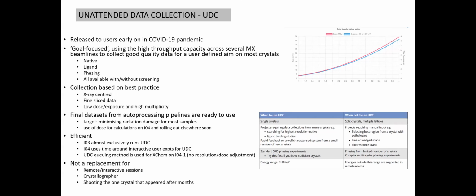In I04, we already use the dose calculations, and we're going to roll that out to other beamlines. The final data set is then ready to use for subsequent processing and so on. This mode, as Dave mentioned yesterday, is almost exclusively used on I03, and it's used on other beamlines interleaved with interactive use. It is quite a successful thing. We've collected more than 130,000 samples, I think, and people are really happy with it, but it is not a replacement for remote or interactive sessions.